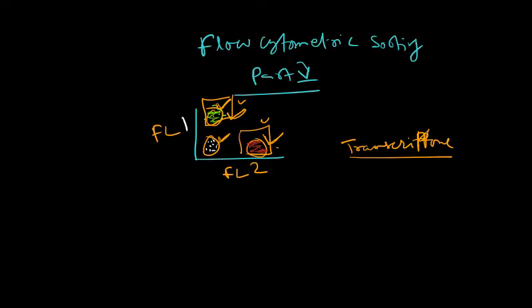So how does the sorting happen? By flow cytometry, we can distinguish, we can appreciate the different populations. We can appreciate these three different populations. Now, how can I get these populations? In layman's terms, I can say that I rely on the instrument. I do the gating. So this is gate 1, this is gate 2, and this is gate 3. And I tell the instrument, okay, fine, sort the cells of G1, G2 and G3. Then the instrument can sort and separate them for me. So that is how I'm relying on the instrument.